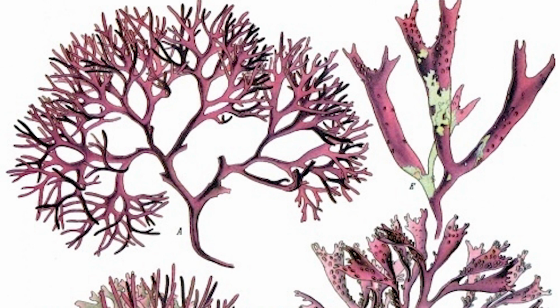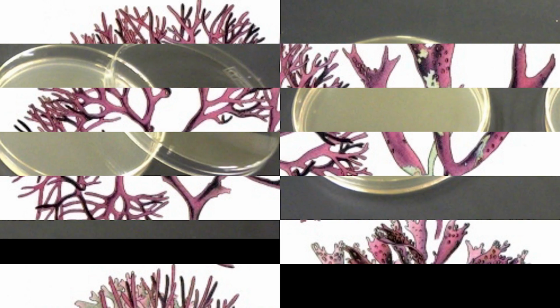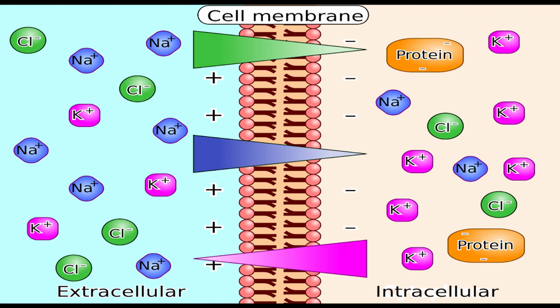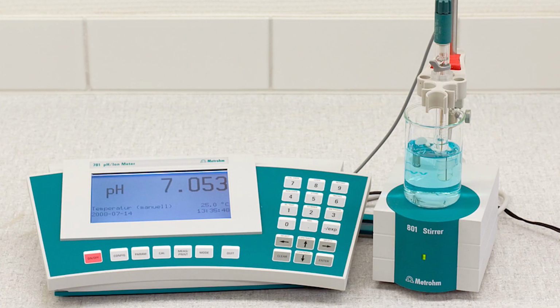It has no nutritional value and does not interfere in the growth of bacteria. It is used to solidify the medium. Agar melts at 100 degrees centigrade and solidifies at 42 degrees centigrade. Sodium chloride. Sodium chloride is used to provide electrolytes for the growth of the bacteria and maintains the osmotic equilibrium. The pH of MacConkey agar.